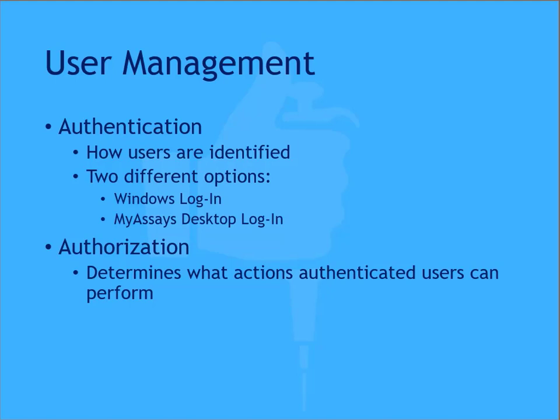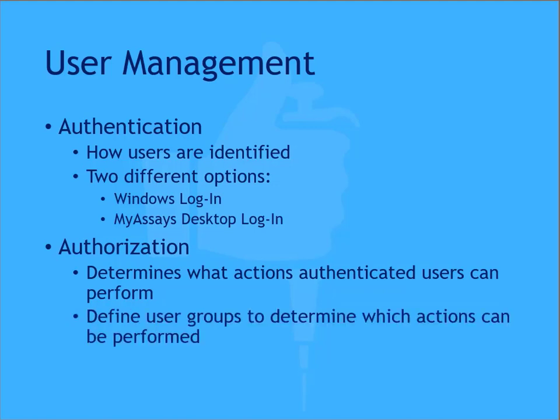Authorization refers to the actions that users are allowed to perform. MyAssays Desktop Enhanced Security provides control over its key features so that the administrator can specify exactly which functions each user can perform. Each operation can be individually permitted or denied for each user. To simplify this management, authorization is managed using user authorization groups.